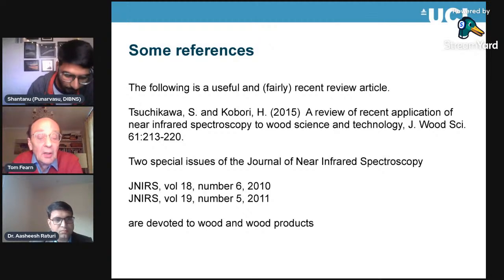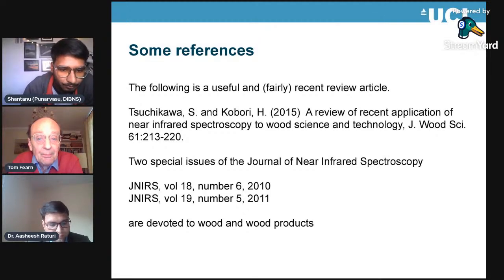Yes, for sure. It's being used. There are quite a lot of applications in fruit. You want to harvest fruit when the sugar content's right, and you can measure sugar content with NIR. You can do it to some extent on intact fruits, although clearly you've got the problem again that you're not going very deep in, but there's correlation between the surface and the depth.